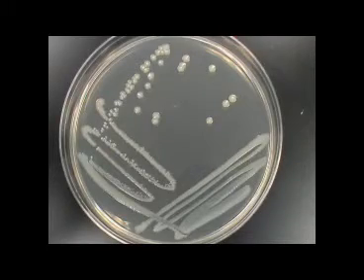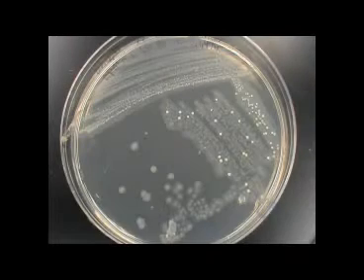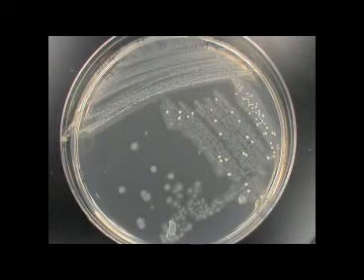Shown here is a proper isolation streak plate. Notice that some of the bacteria are growing by themselves in single colonies. When trying to determine isolation, sometimes two bacteria will grow together and look very similar.